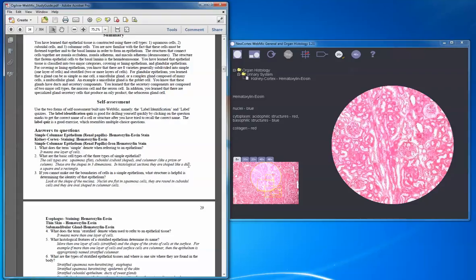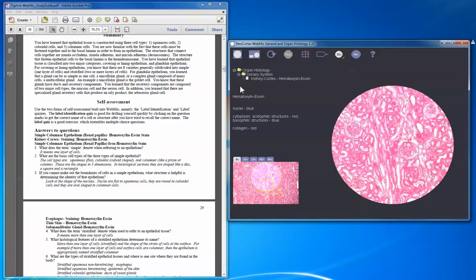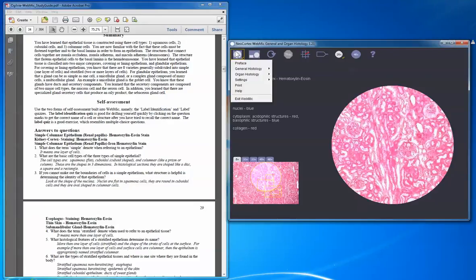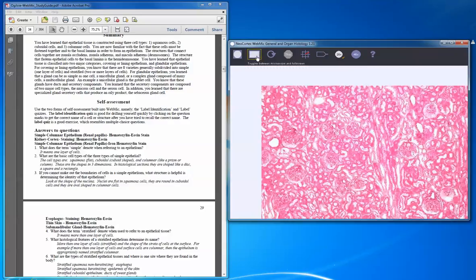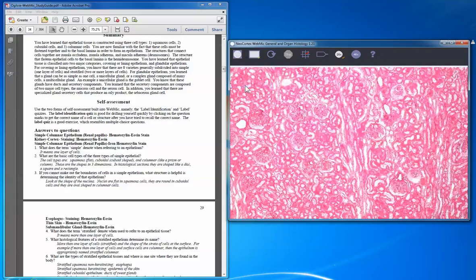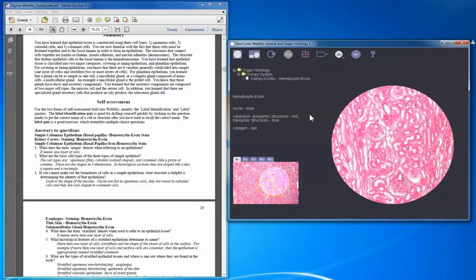How you organize all of this information is your challenge — we provide you the resources. If you go to pages 12 and 13 in the syllabus, you'll see what other students have done. As instructed in the WebMIC tutorial, you can print this. The print function isn't working for me in this particular setup, but if you're in the program itself it will work. You can also remove the mask and screen capture the image.